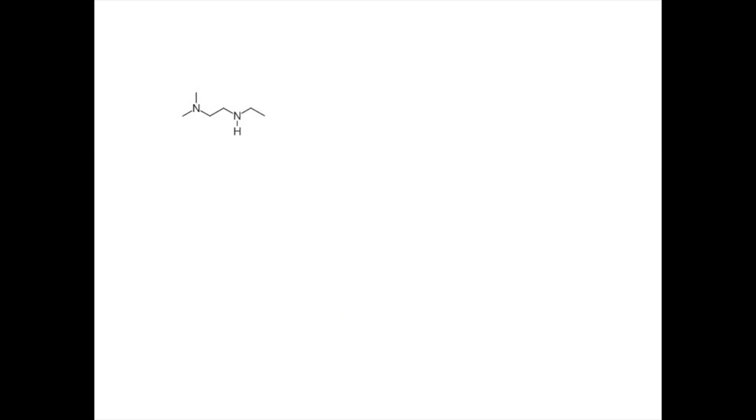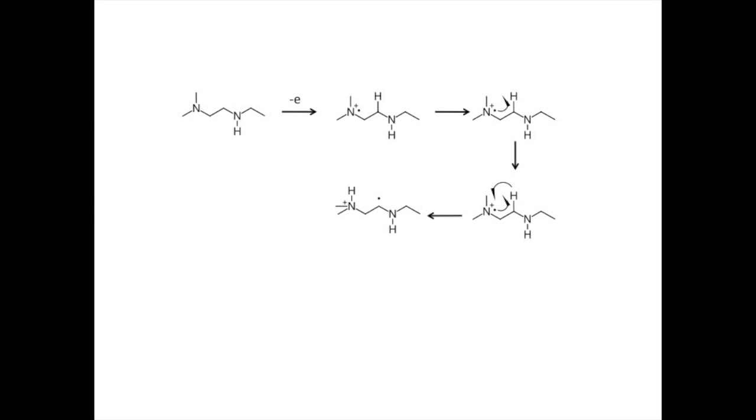How might that happen with our candidate structures? Consider ionizing the nitrogen on the left. If a hydrogen atom migrates to the nitrogen, we might lose dimethylamine by inductive cleavage. That would give us a charged fragment of 71 atomic mass units.